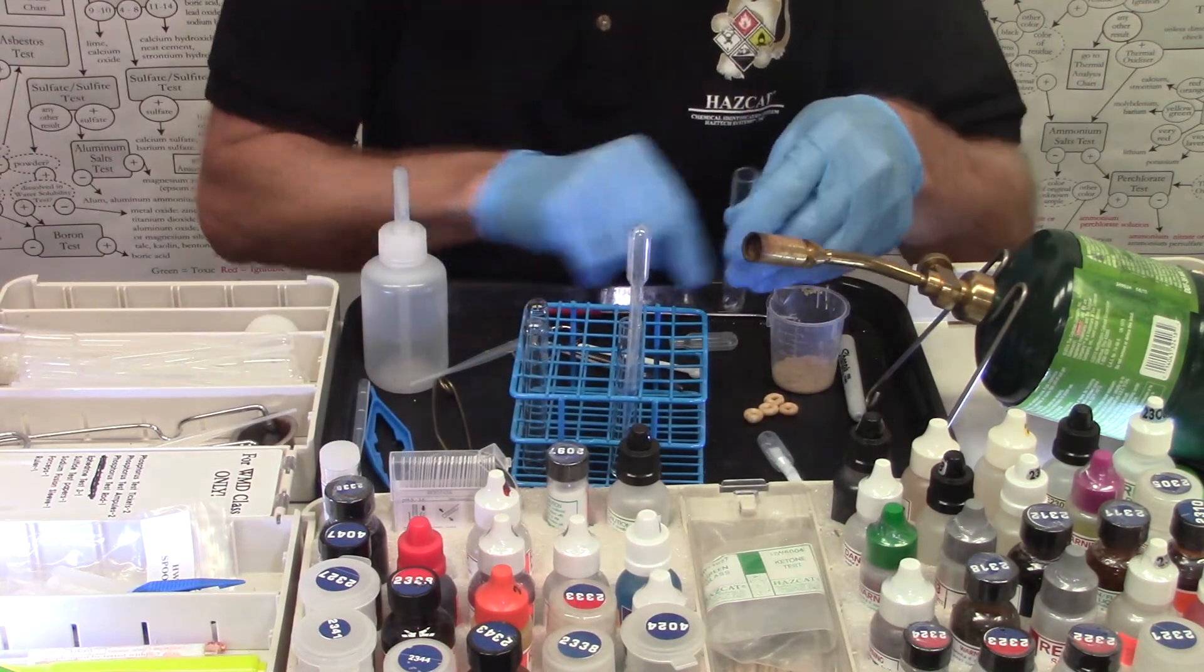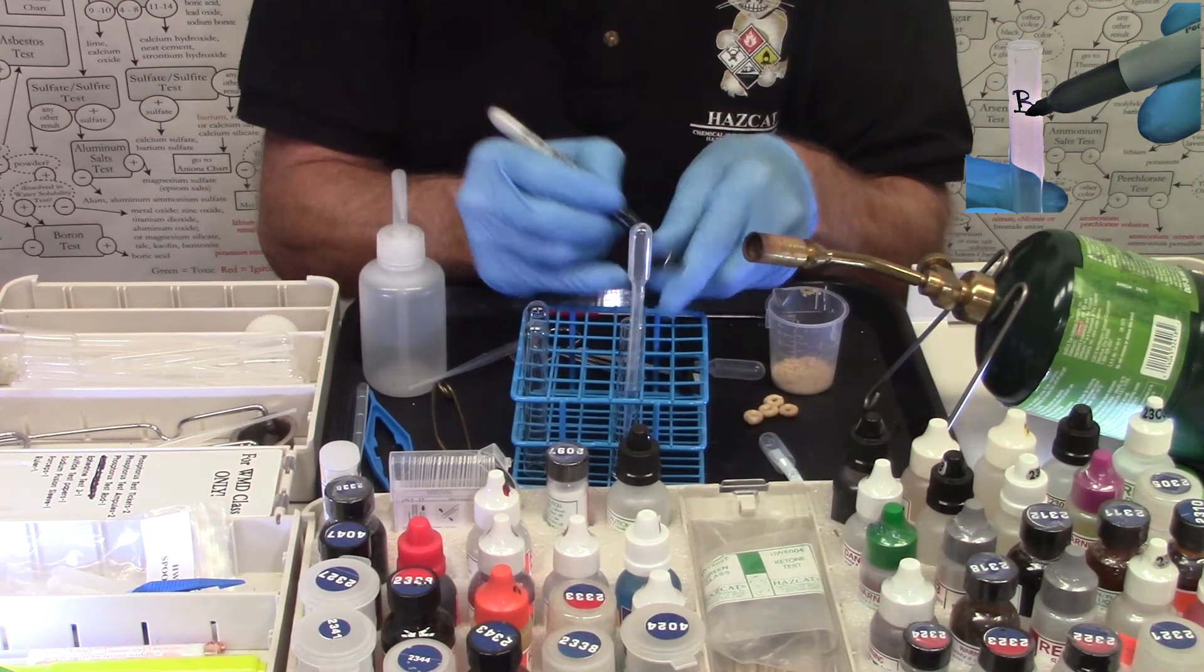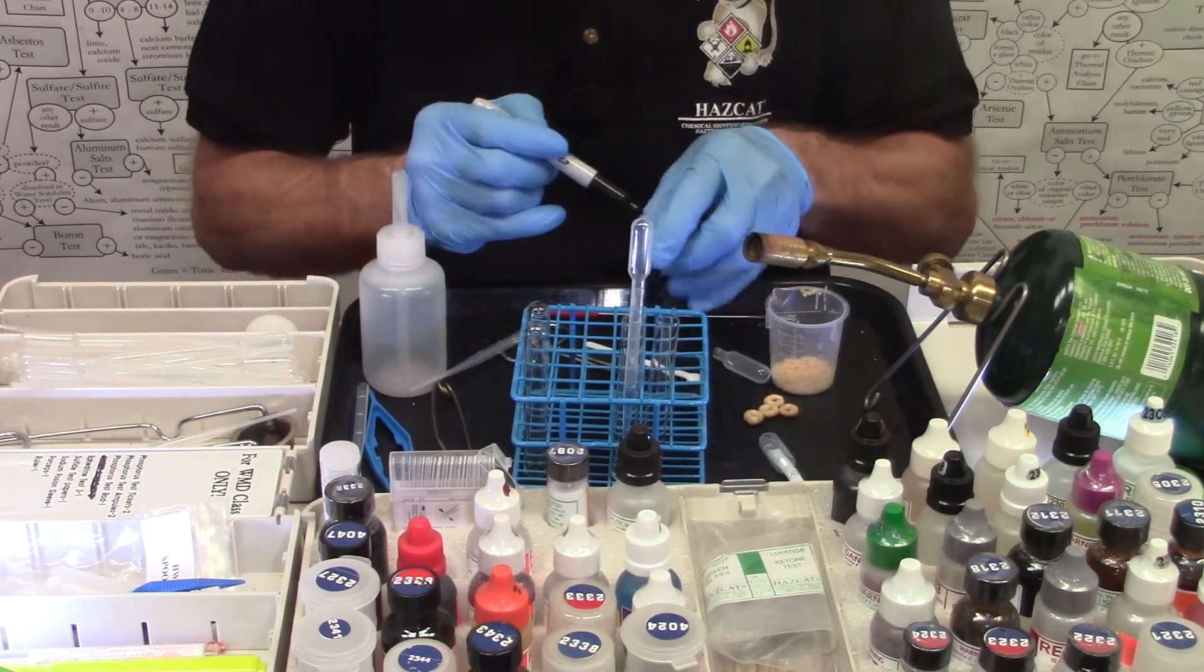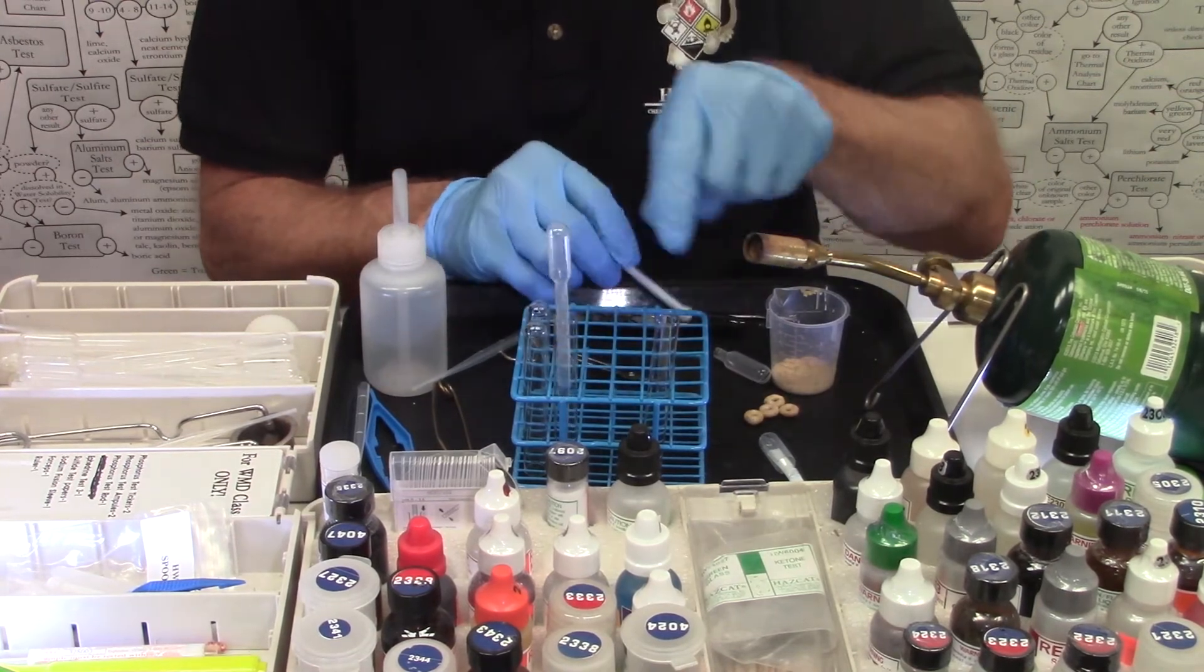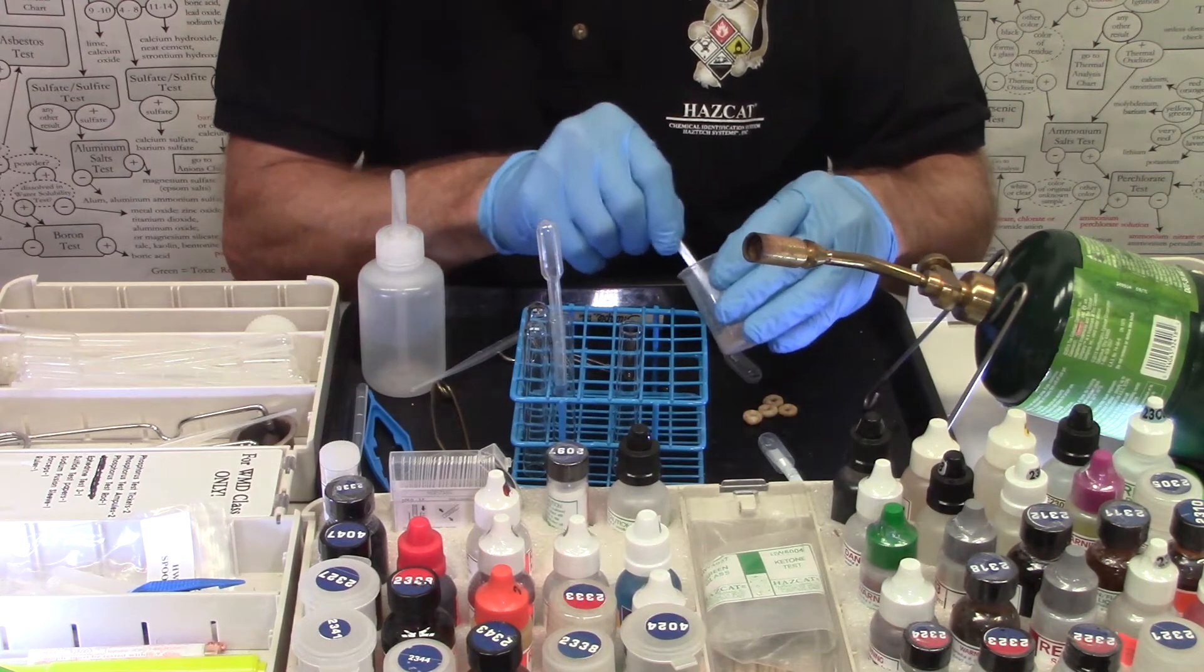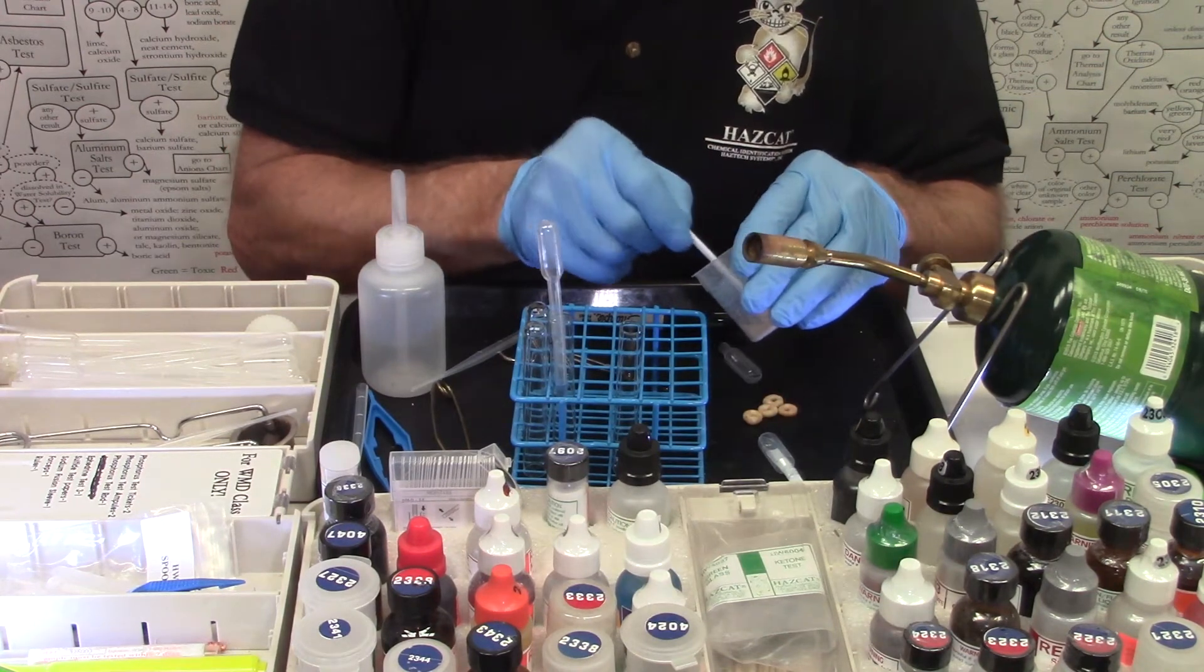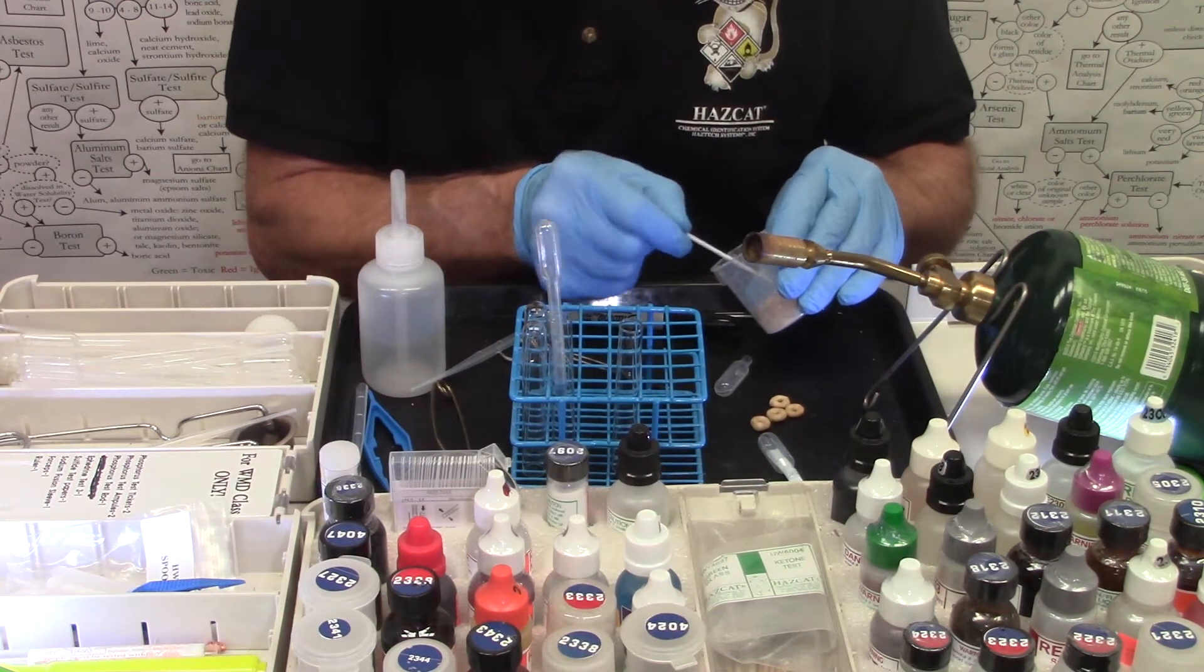Take a new test tube. I'm going to mark it with a B now. And into that test tube, I'm going to put my sample. It's a half inch of a liquid or a half spoonful of a solid. Here my sample today are Cheerios.